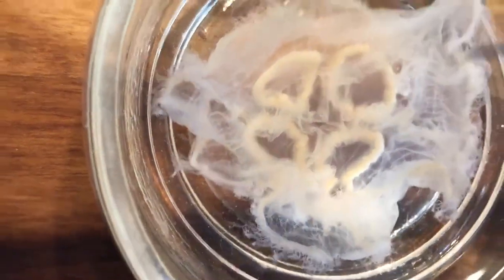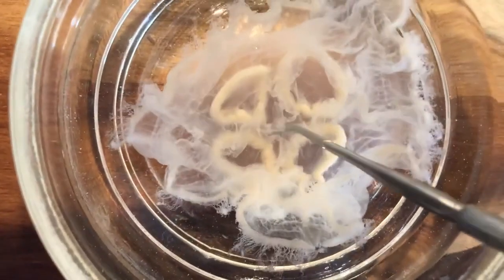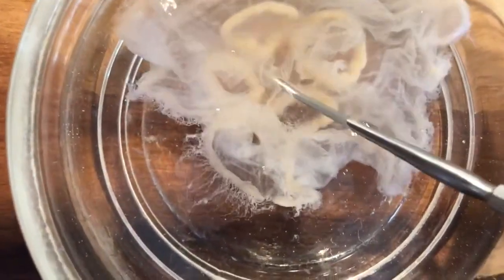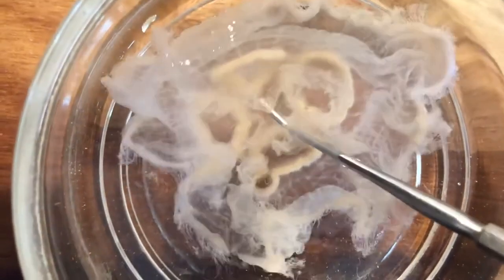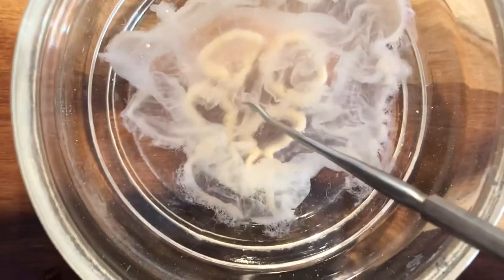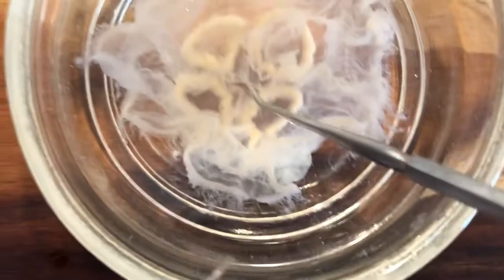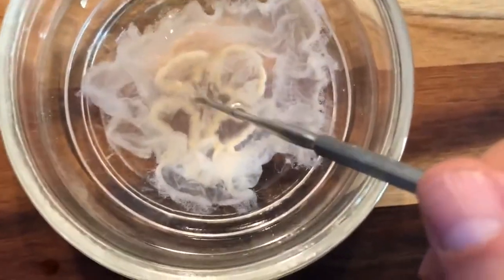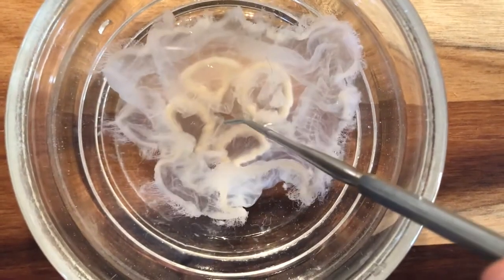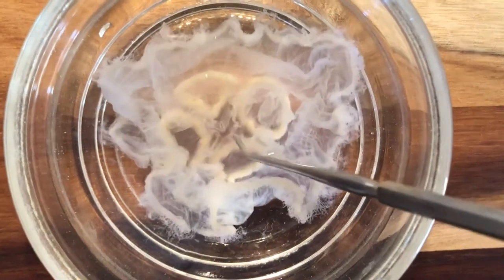Moving back towards the center of the organism, again on the oral surface. If you poke a probe into the mouth, you can see it through the body — it's actually inside the jellyfish. Right now my probe is in the gastrovascular cavity. The gastrovascular cavity is lined by gastrodermis, which is derived from endoderm and has several functions: digestion, gas exchange, release of metabolic wastes, and discharge of gametes.